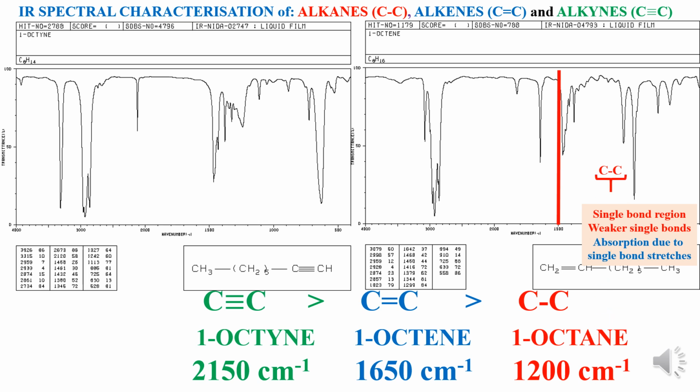So absorptions due to single bond stretches appear in the single bond region as they are weaker bonds.